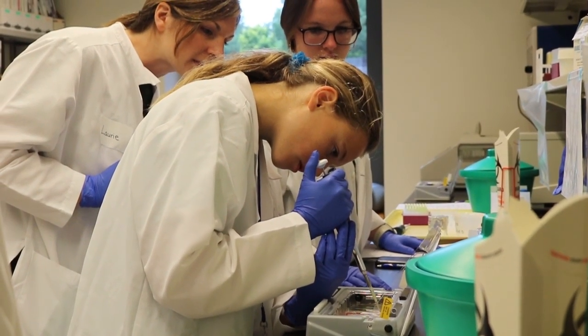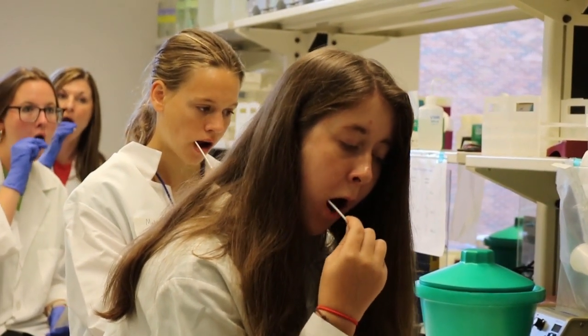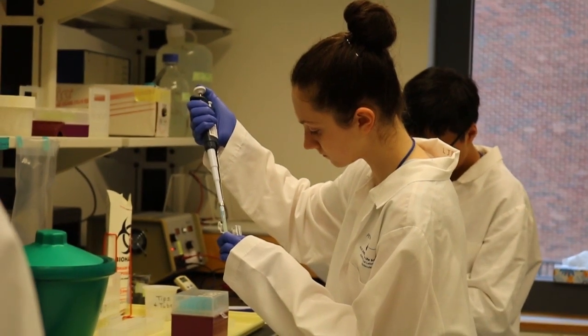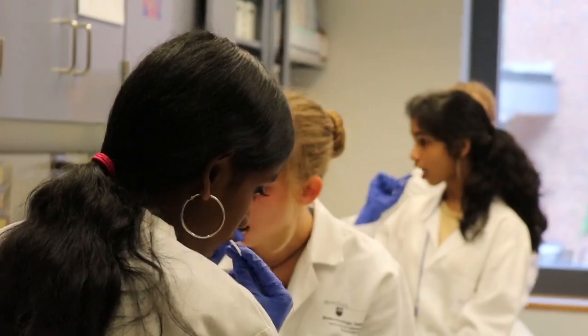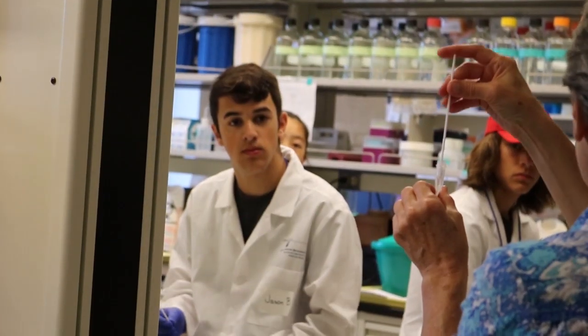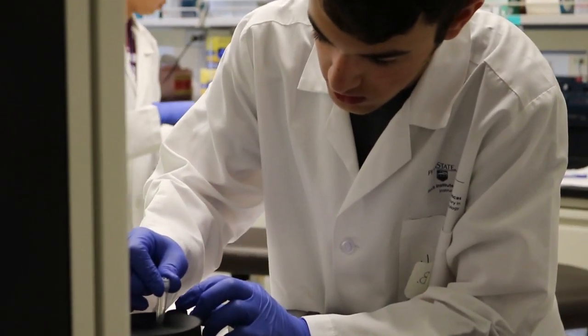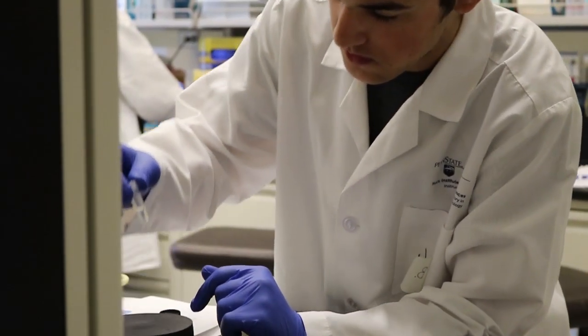Over the three days they were able to clone DNA in bacteria from beginning to end. They were able to complete cloning a piece of viral DNA in bacteria down to the analysis of the clones that they have made. So one focus is recombinant DNA, and the other one is PCR amplification.